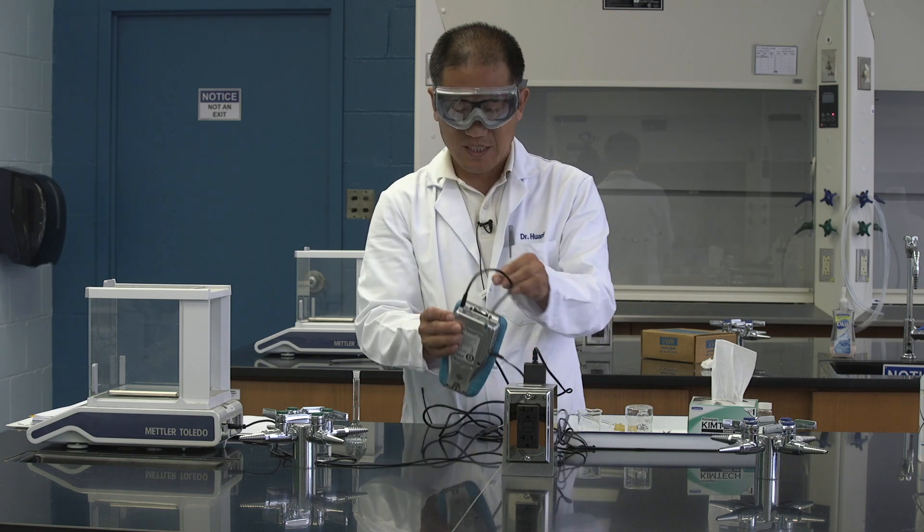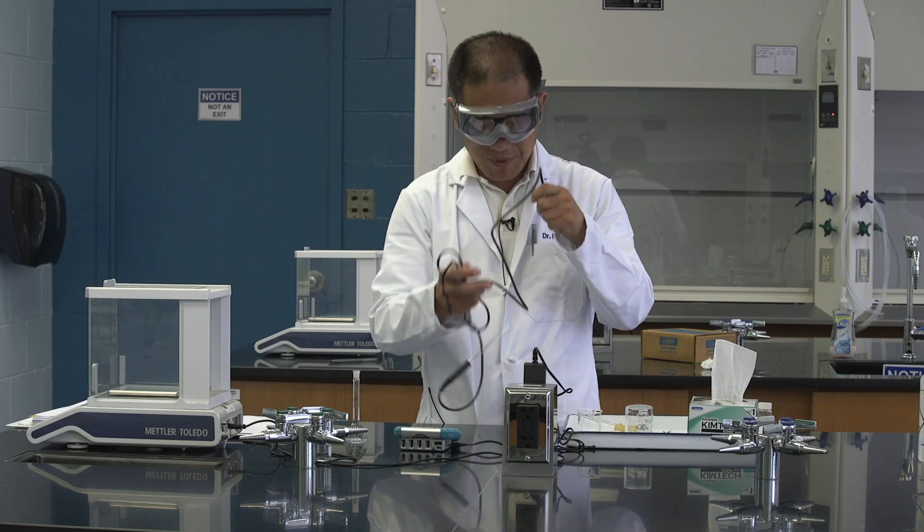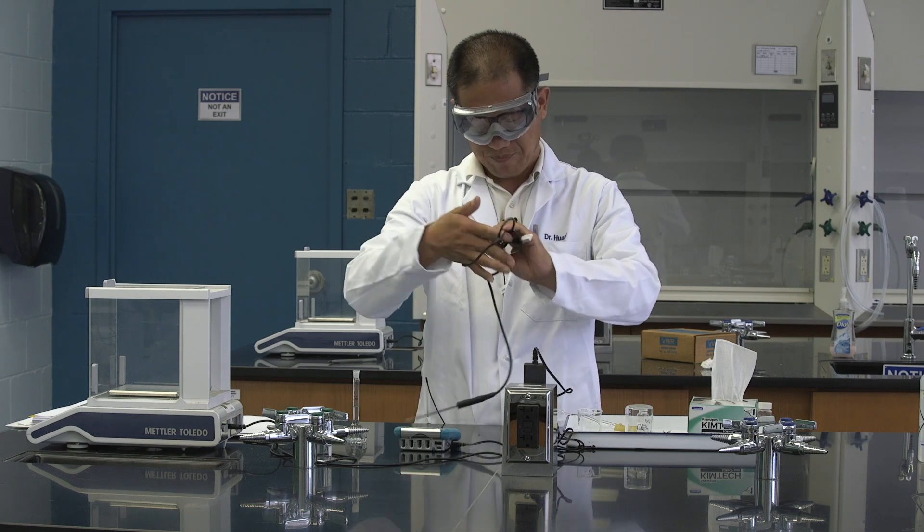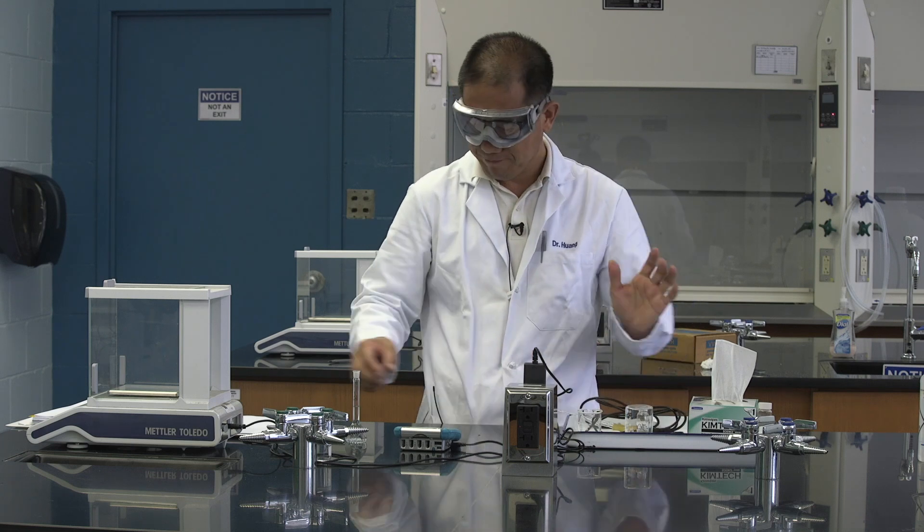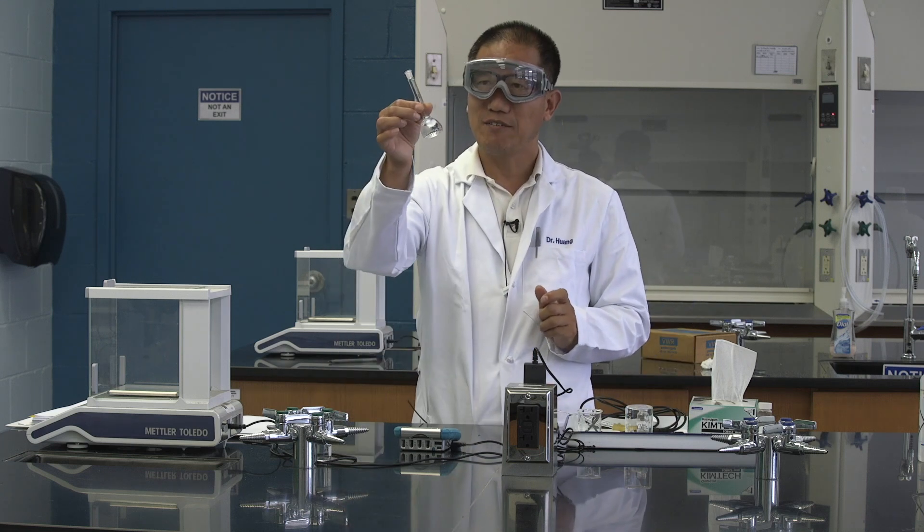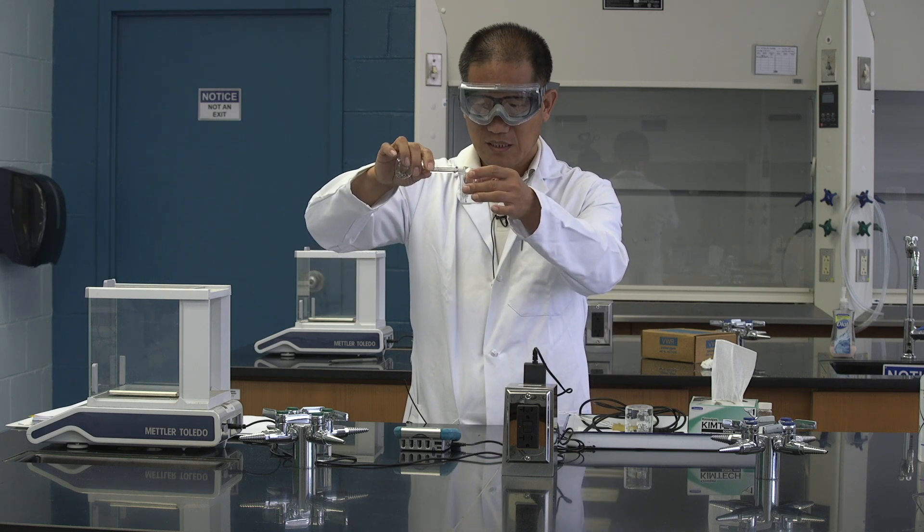At the end, do not forget to clean your mess. Otherwise, the lab manager will not be happy. This is what you should do for this experiment. Unplug the temperature probe and put them inside the tray. And then you have your unknown liquid here. Use a beaker. Try to dump out what you have. Make sure you only dump out the liquid.